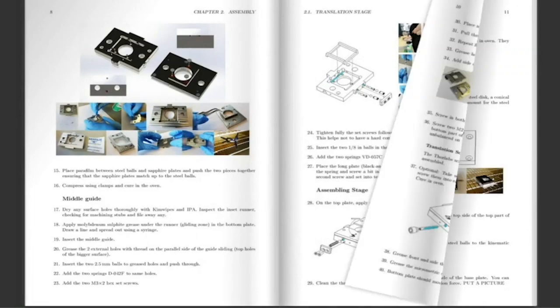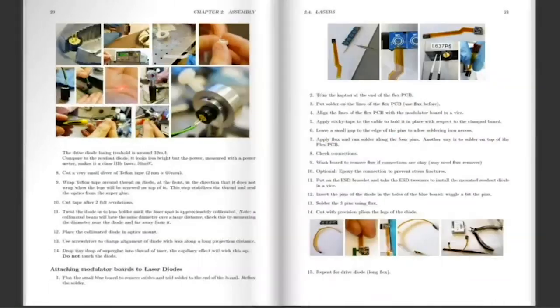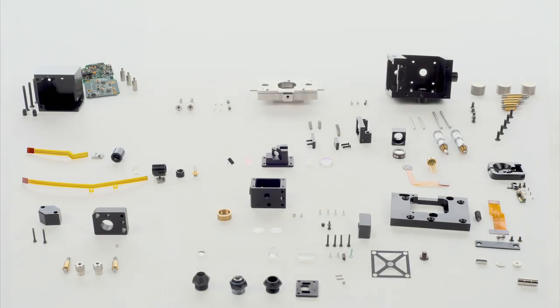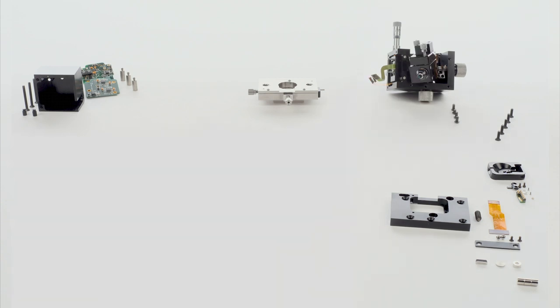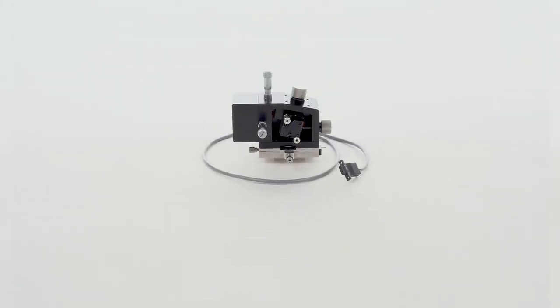When people come for a workshop, they receive all the individual parts for assembling one of our microscope heads. After this assembly period, they go to the lab, test, and learn how to use the microscope on their own.